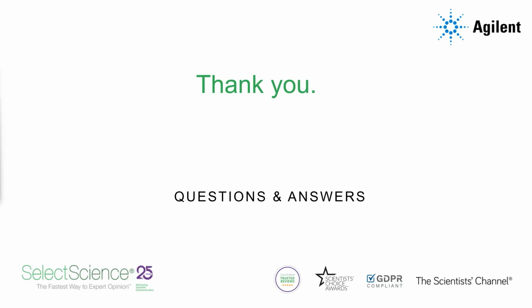Thank you. And then another one asking, what size double emulsion droplets does it make? We have 2 cartridges. One that we call a D20 that makes small double emulsion, so they are about 1.6 picoliters, and then we have the D50 that makes droplets of around 100 picoliters.